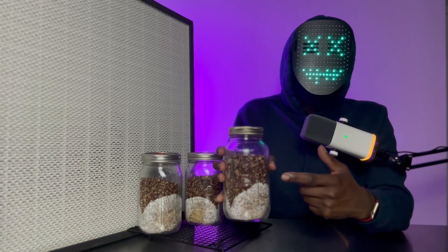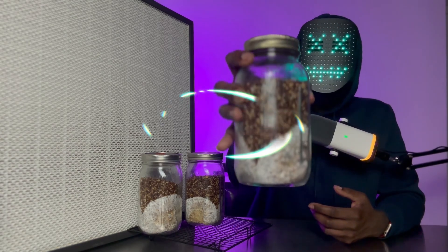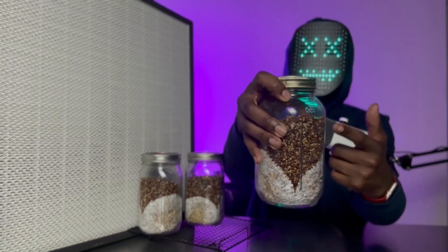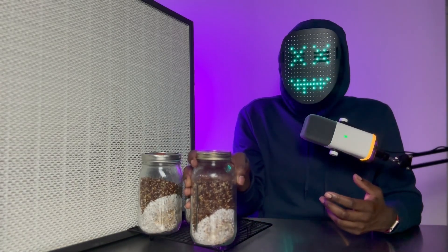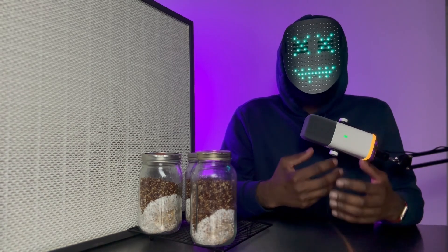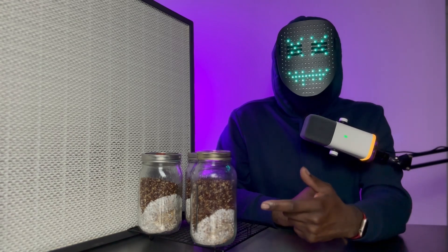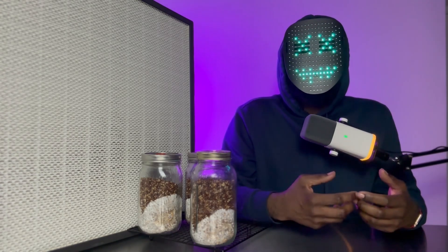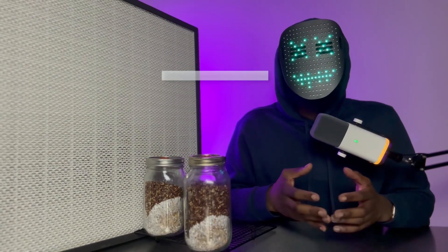You also want to break, shake, and redistribute the colonized grain in your grain jars because while your mycelium has grown out nice and healthy, the uncolonized grain in your grain jars represents a liability. There are a lot of bacterial colonies and mold spores that would love to call this place home. So you BSR so that your mycelium can maintain a competitive advantage.